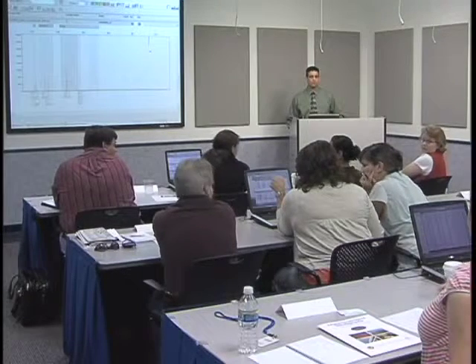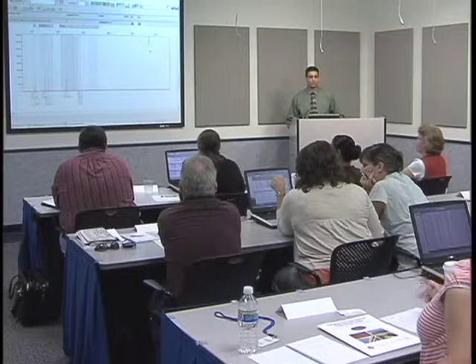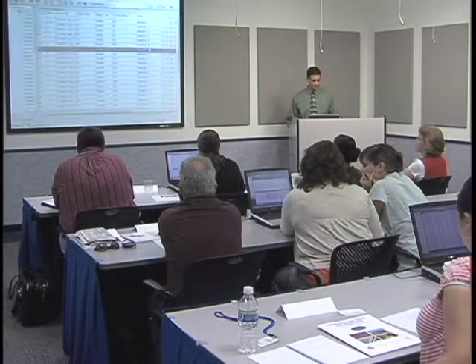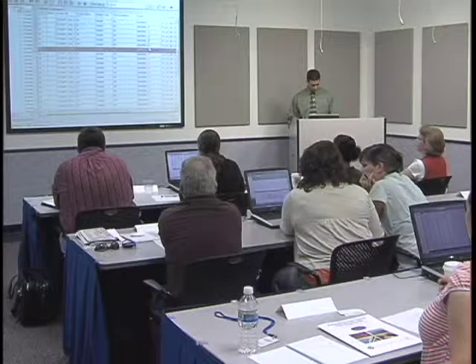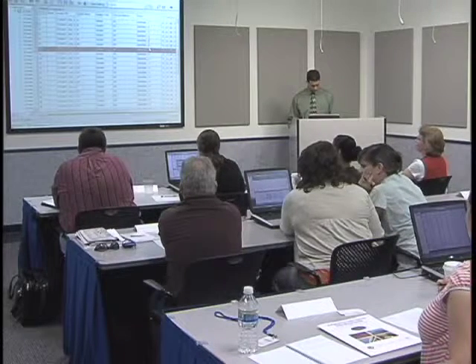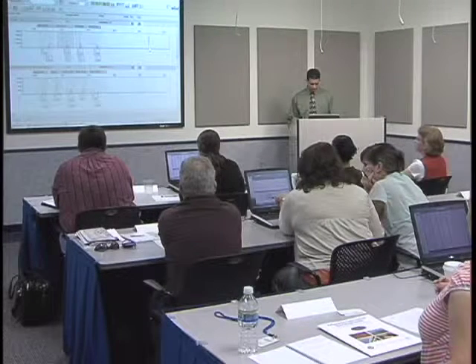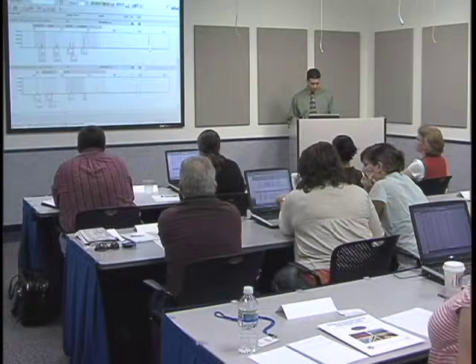We did those 2 samples with 2, and our other samples with 1. Okay, what's one of your other samples? 50. Let's see what 50 did. 50 is about the same peak heights as the one with 2 washes.